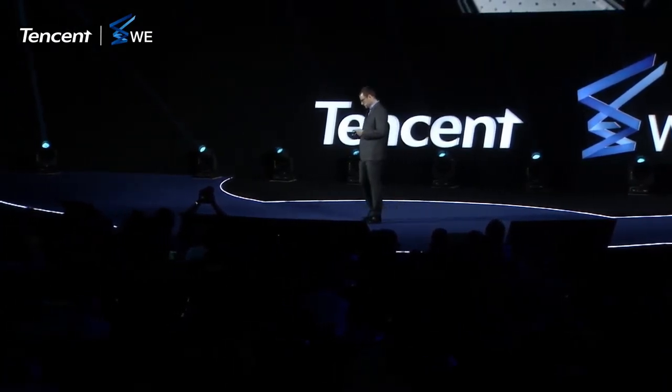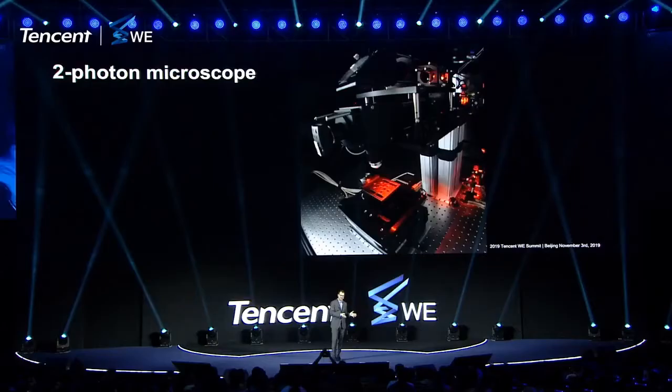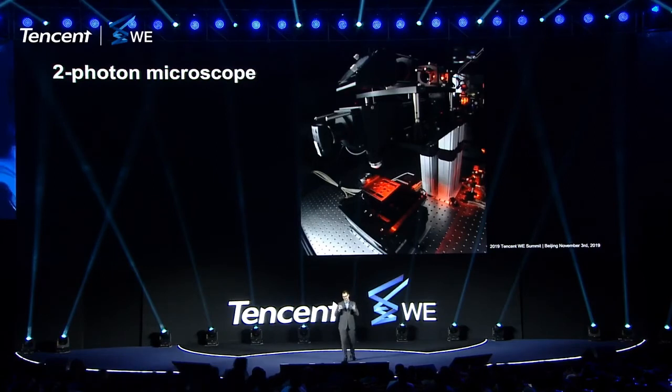Now, all this time I was talking about this molecular biology aspect, but what about the other half, the 2-photon microscope? Well, the same principle applies. Even though this is a very complicated machine, these sort of machines are fundamentally modular. That means that I can take one module, where maybe I have an idea of how to improve it, how to make it cheaper. I improve it, I publish this, I put it into my microscope, and I've saved maybe 5% of the costs. And then someone else comes along and thinks, oh, maybe this module, I can change it. I take it, I modify it, put it back, and we've saved another 5%. So if we keep doing this, we can really push down the cost of these kind of microscopes.